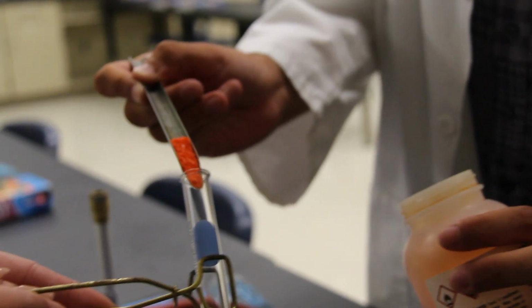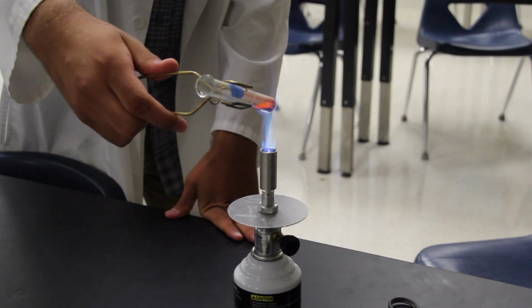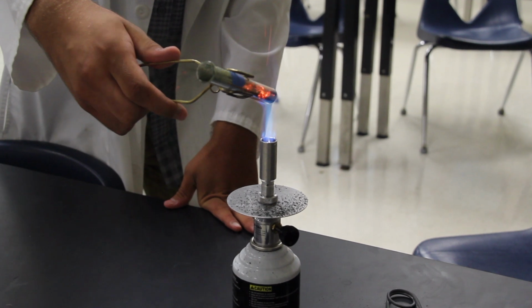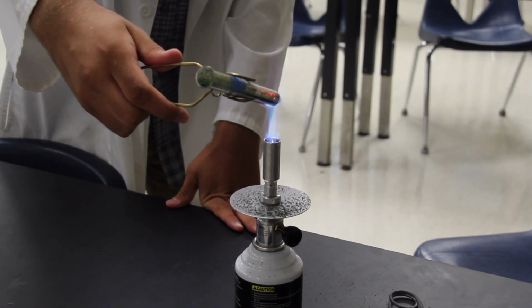Don't worry, it's not as scary as the word implies. The decomposition of ammonium dichromate is an example of an exothermic reaction, in which energy, or enthalpy, is given off. This type of energy is measured in joules. The standard enthalpy change for this reaction is negative 315 kilojoules per mole, meaning that 315 kilojoules of energy are given off for every mole of ammonium dichromate that is decomposed.